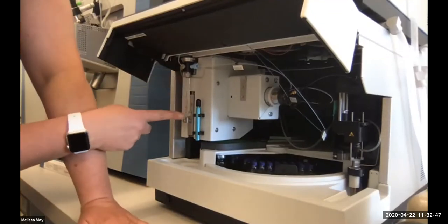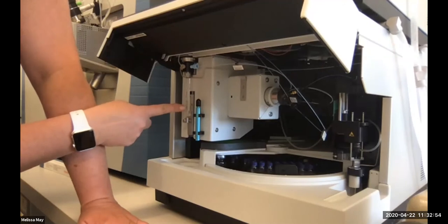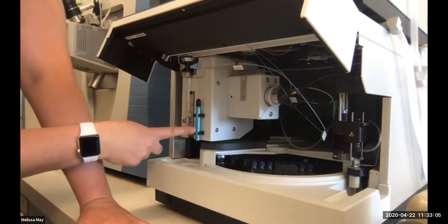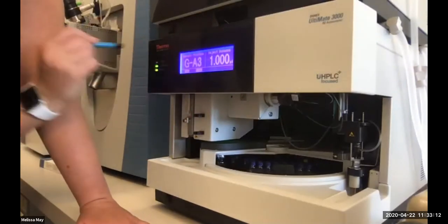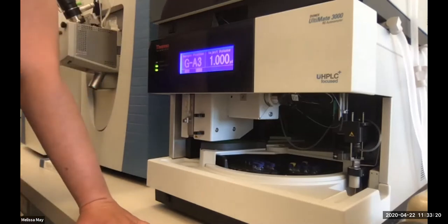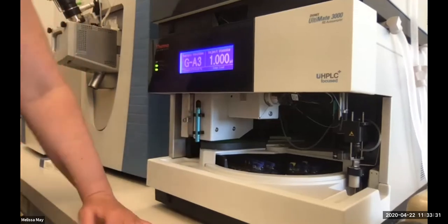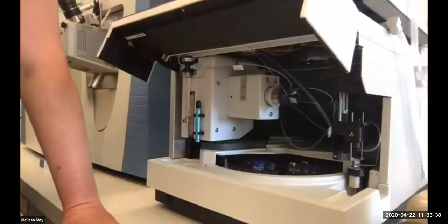These are the fluidics, and this is also filled with buffer. If you see an air bubble in here, you need to get the air bubble out. I've never had to do that, so you're probably going to have to call a service technician, but you could basically take this apart. This little fun thing is our wand. Our wand controls this, so you can have manual control over the auto sampler or any of these different components. It's way easier to operate from the computer. Really the only time I ever use this is if I'm clearing an error message that comes from the rear seal wash fluid needing to be replaced. That's the error message we talked about.